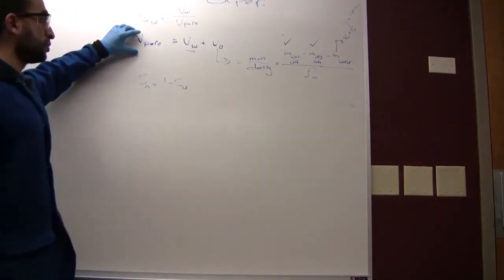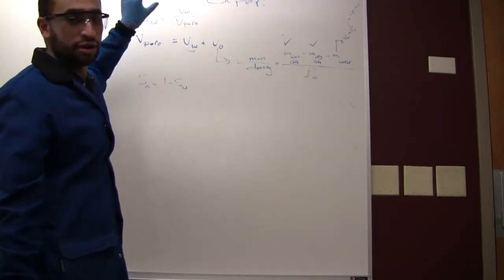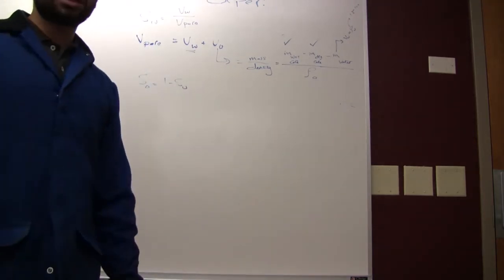After we get the volume of pore and we have our volume of water from our experiment, we can get the saturation of water, and from it we can get the saturation of oil. So now let's head over and see how the experiment is going.